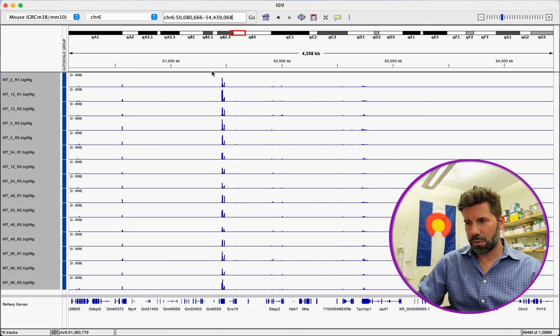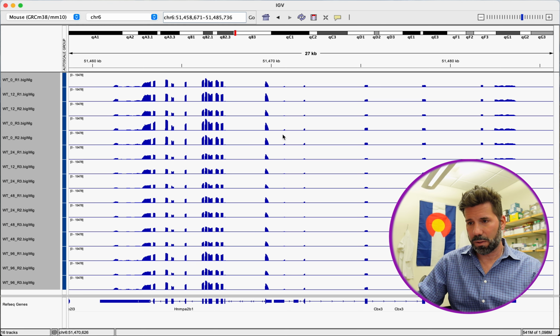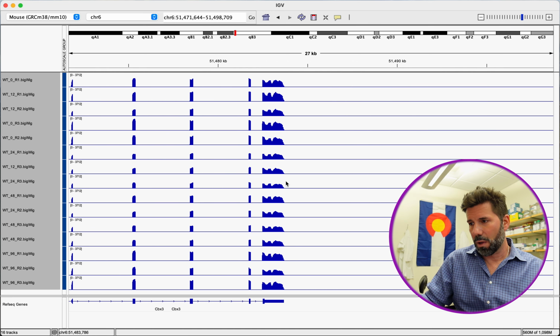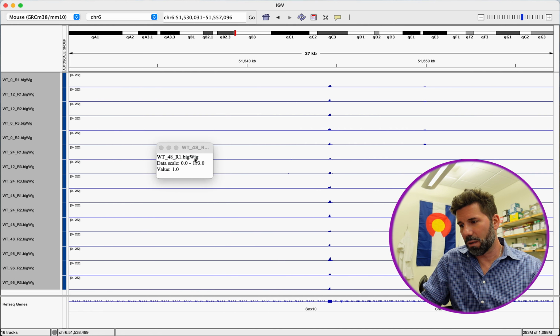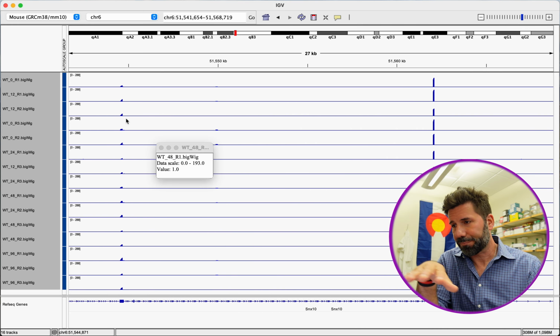So, ooh, wow, this looks like a very abundant gene. And then we can just zoom in on it here. Boom. It's abundant in all of our samples, which is great. It looks the same, and it is not being affected by DOX. And you can also just hold down and scroll across the genome. I find this really fun. It's like a video game for genomics, and you get to know the genome, and you can see all of your data group scaled in here.